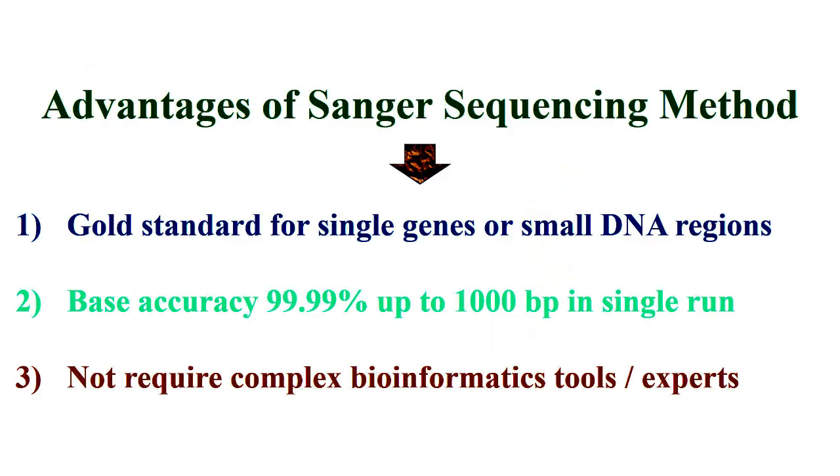So, the Sanger sequencing method is considered the gold standard for single genes or small DNA regions, with base accuracy of 99.99% up to 1000 base pairs in a single run, without requiring complex bioinformatics tools and experts.